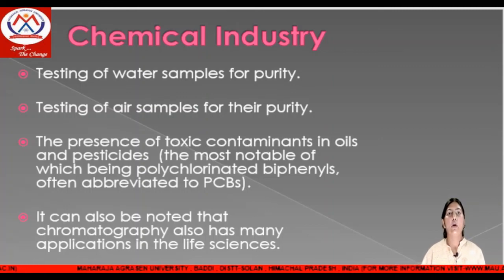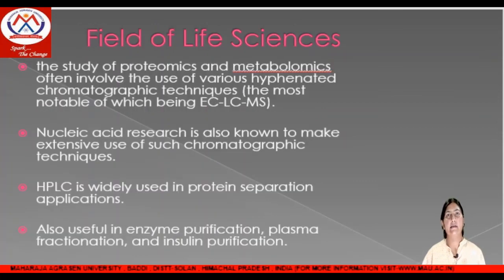It can also be noted that chromatography has many applications in the life sciences. In the field of life sciences, we use it in the studies of proteomics, metabolomics, and protein analysis. Nucleic acid research is also known to make extensive use of chromatographic techniques. HPLC is widely used in protein separation. It is also used in enzyme purification, plasma fractionation, and insulin purification.